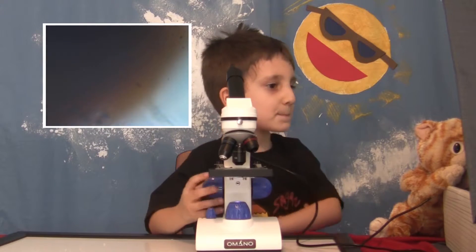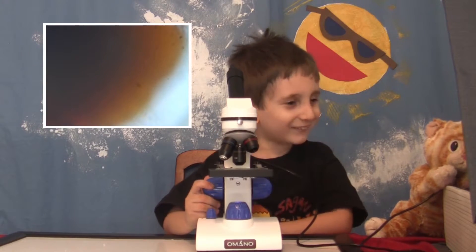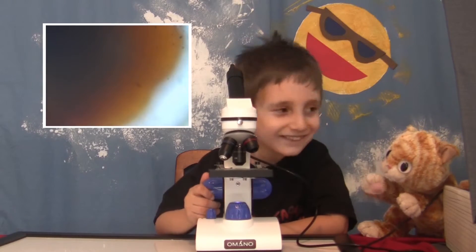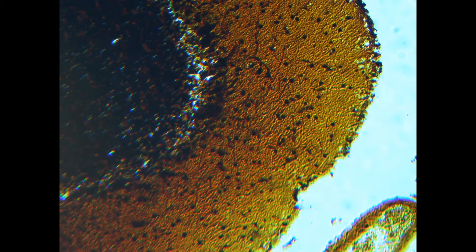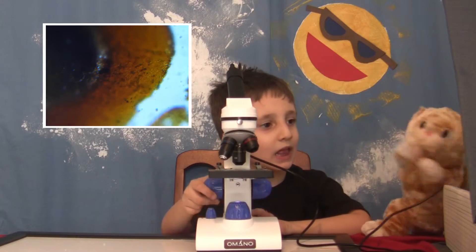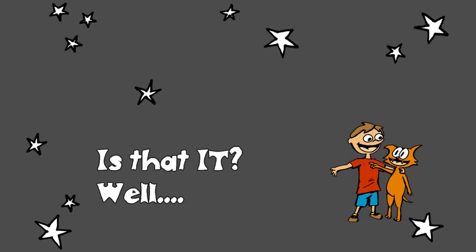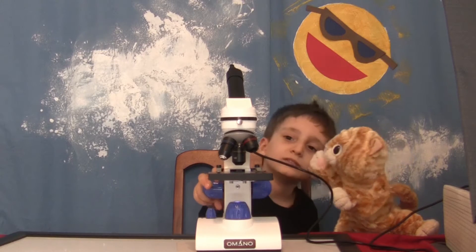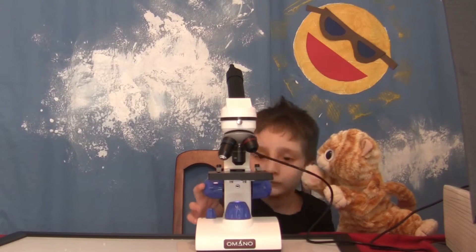No. Can't. Except! Why don't... You said lower power lens. Oh! There we go! There we go! Wow! That's really interesting. Brains! You would think there would be more books in them. You know, all that stuff? The blood and gore? That really was not that gross when you looked at it.